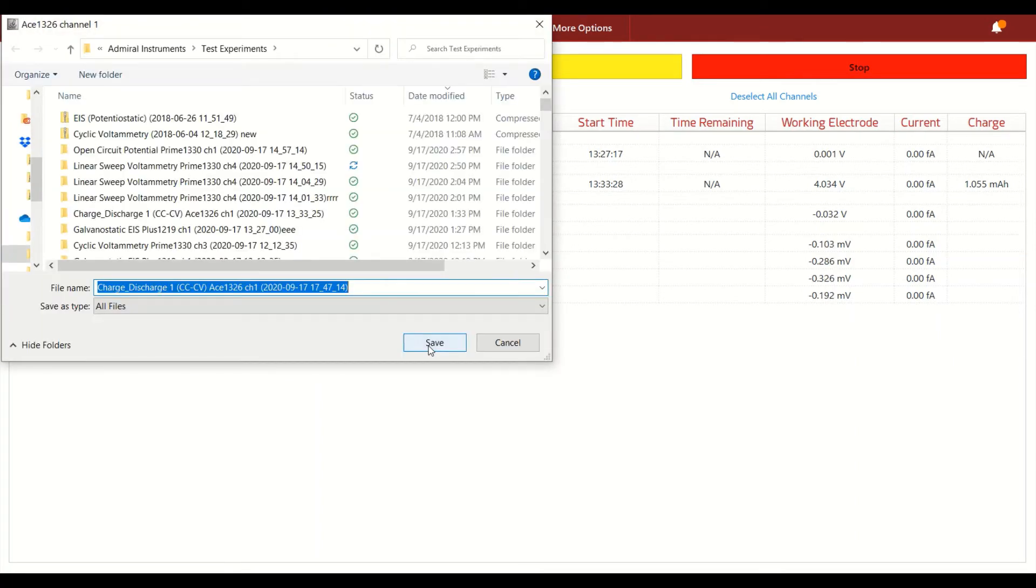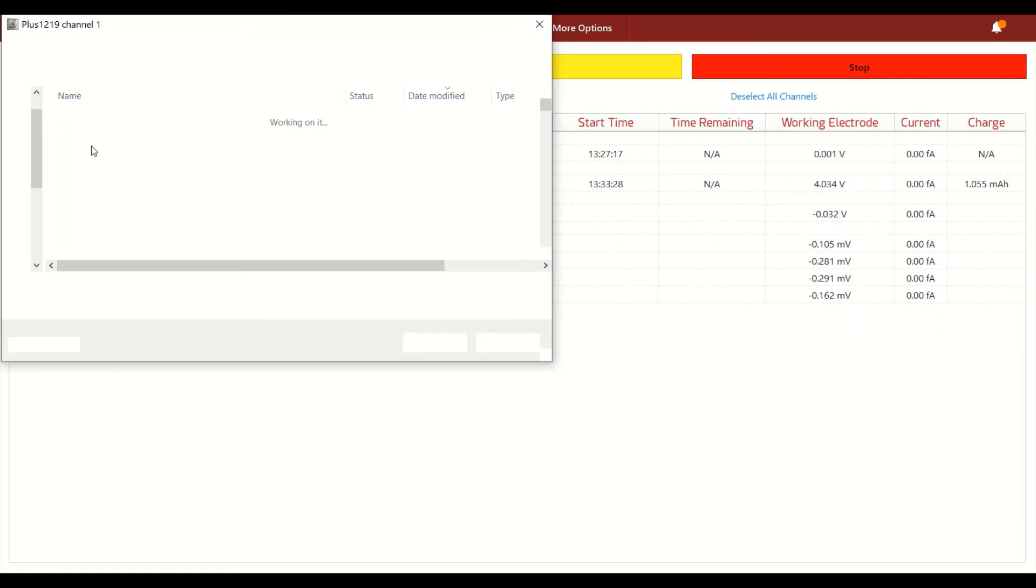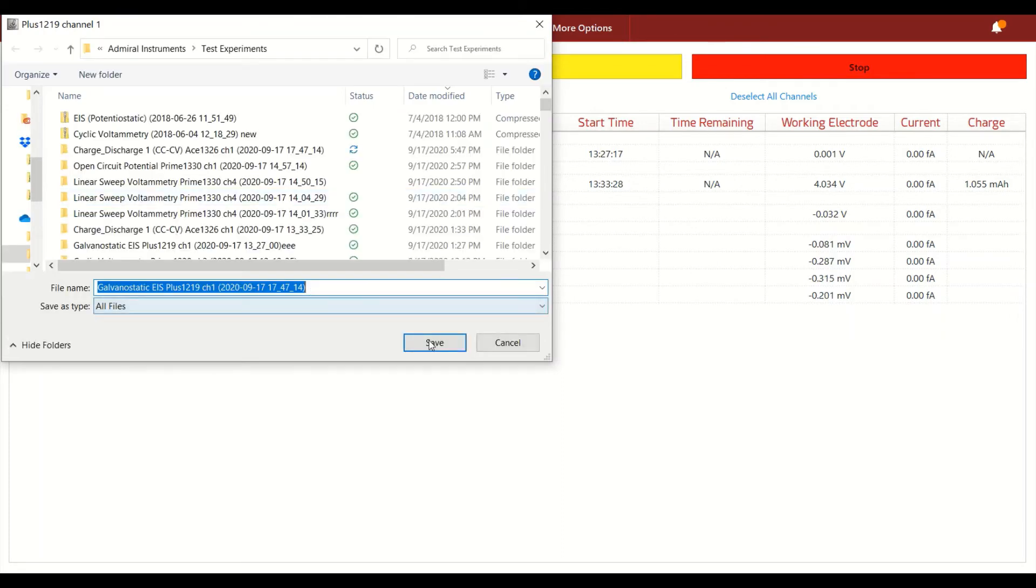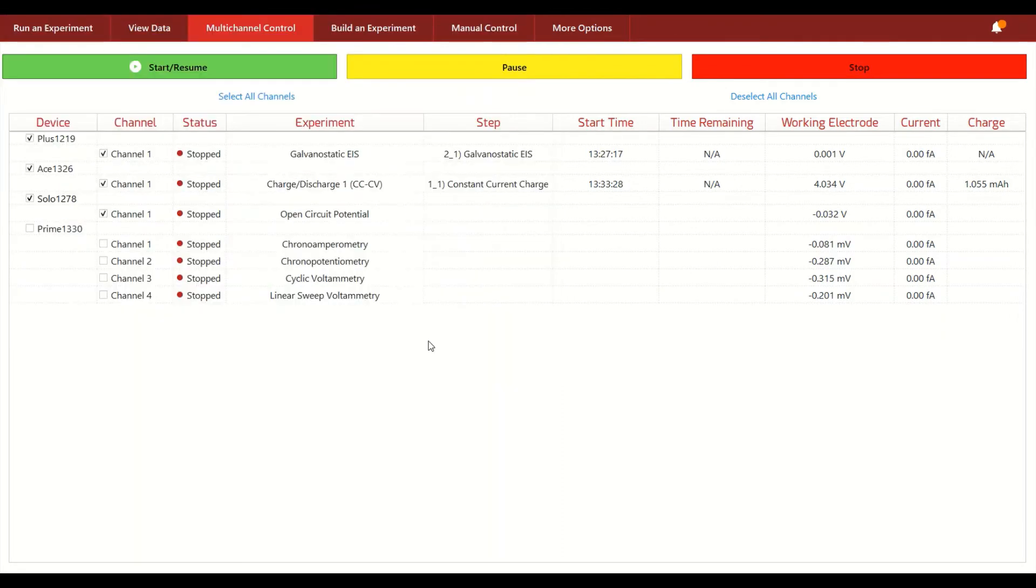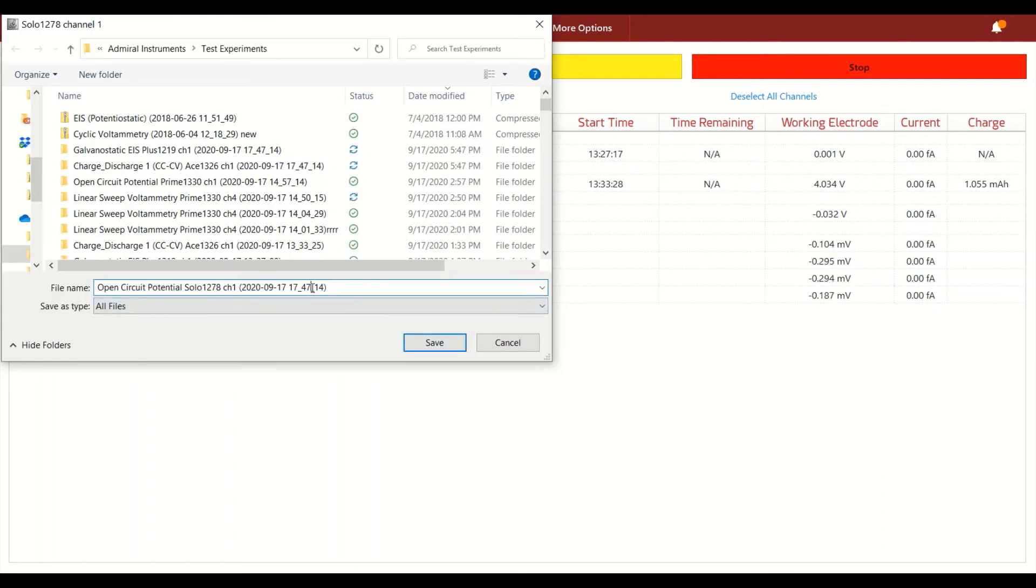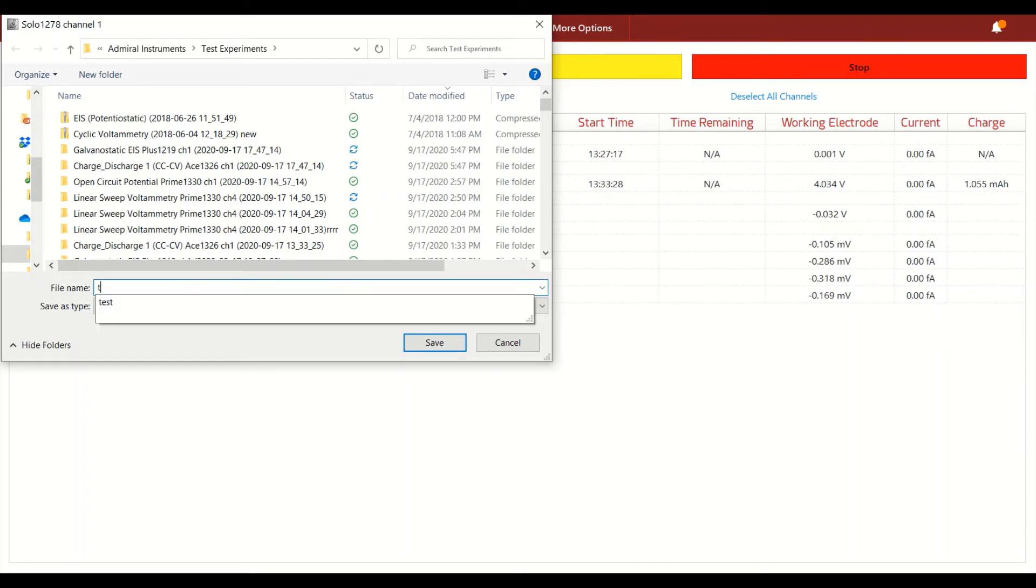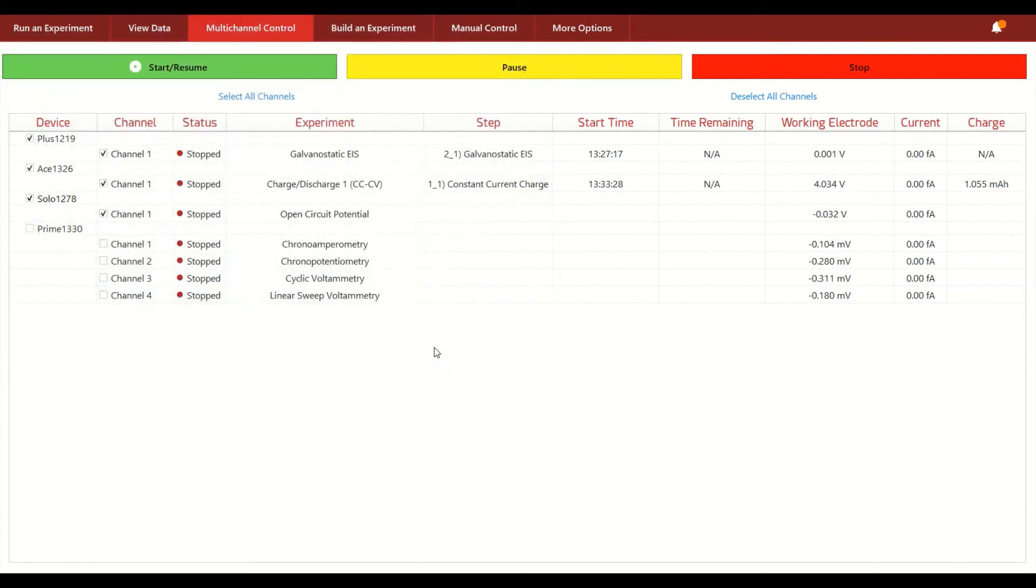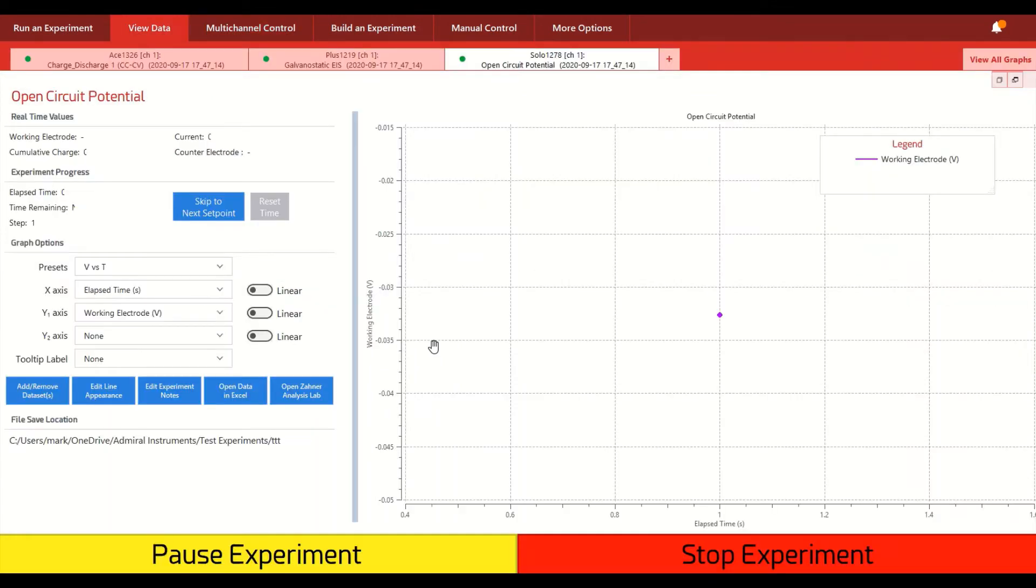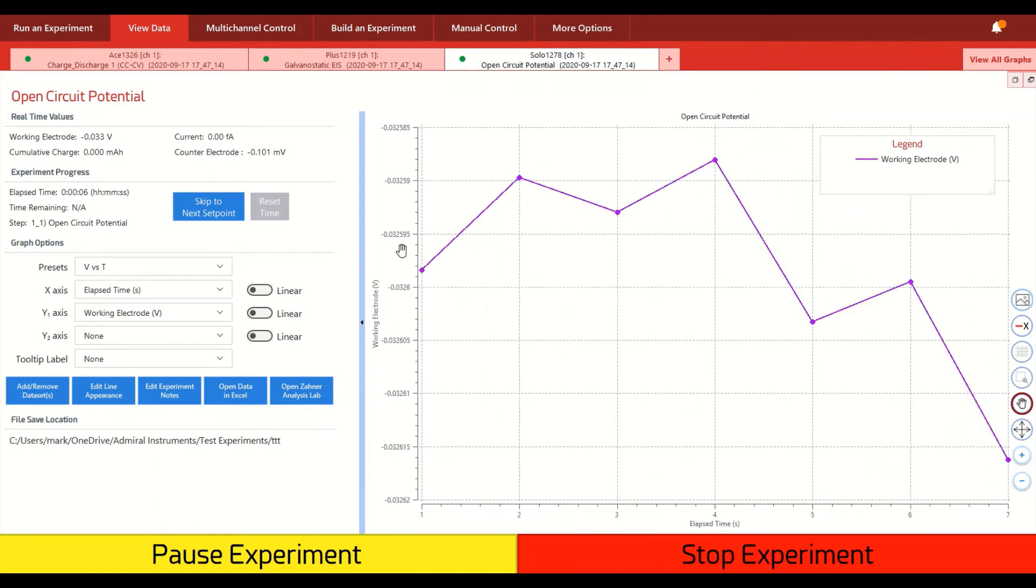After you hit that start button, you are prompted to figure out where you want your raw data to be saved. Once we do that, then in this case, three different channels are going to start up, so we have three different file save locations. And by the way, you can use our default file naming convention that we established here or you can name it whatever you like, it's totally up to you. So now these three channels have their file save locations selected and now they begin operating.